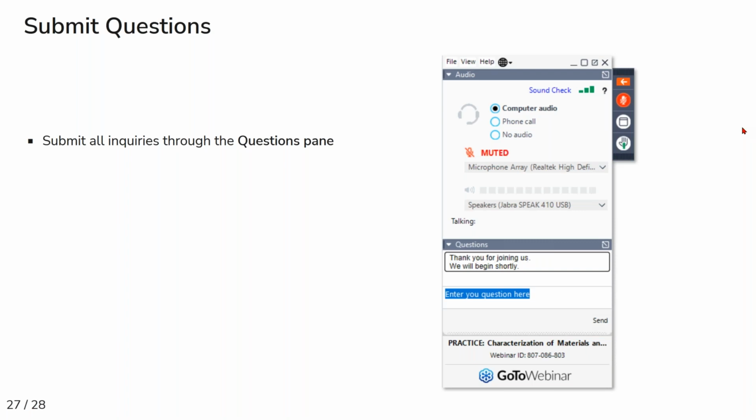Got it. Thank you very much. There's a question about what receptor binds to CDH23 on the second cilium to make that link, the tip link? And is it possible to add vesicles in the sample which are embedded with those receptors to increase the probability of obtaining a full extended tip link?